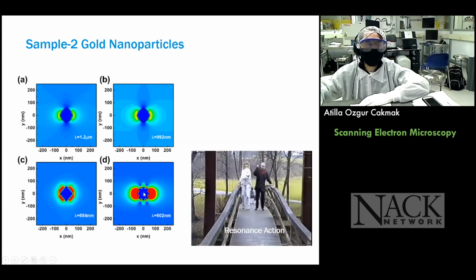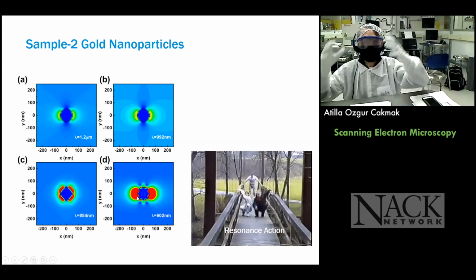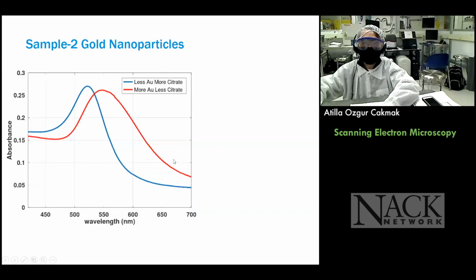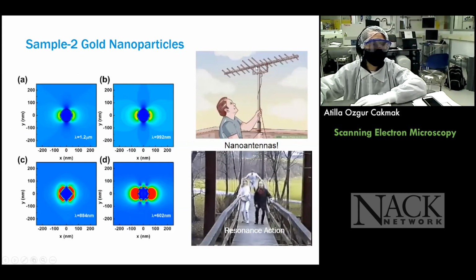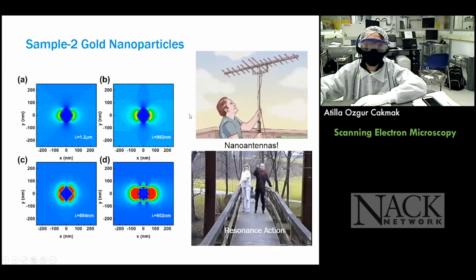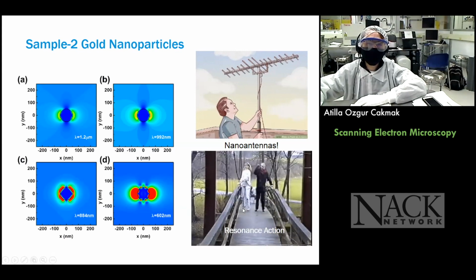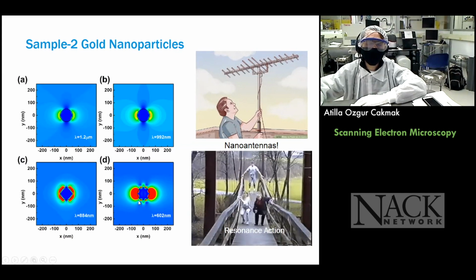You see that the light is intensified. So we captured that. And I always make an analogy between this and the antennas, the good old antennas. Yes, it's exactly like an antenna. You capture now not radio waves, but a certain wavelength of light. And you put that little particle into resonance action, because all that light energy will be transformed into another source of energy.